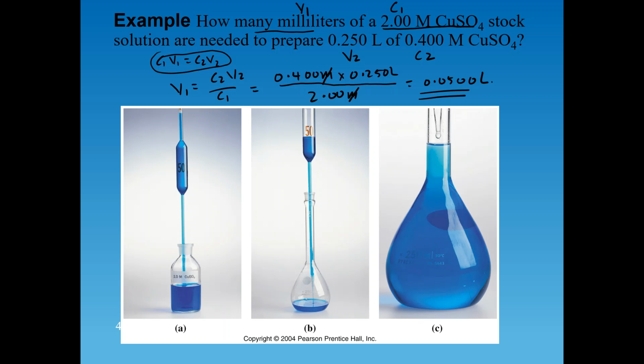The only other thing that you need to do is to shake it up a bit and make sure that the solution is homogeneous as a result. Okay, so that's basically how we do a calculation of this type.